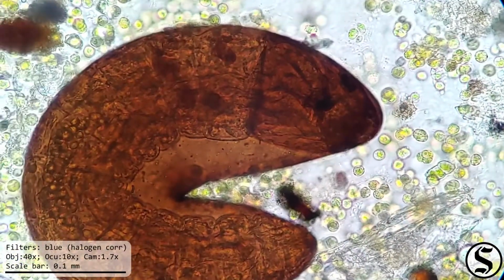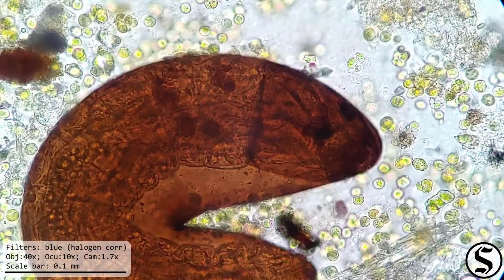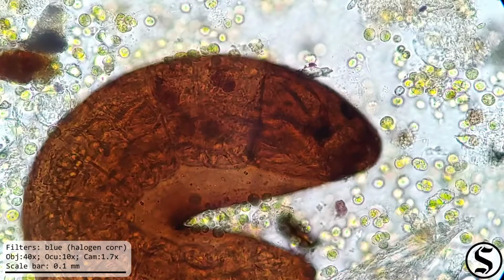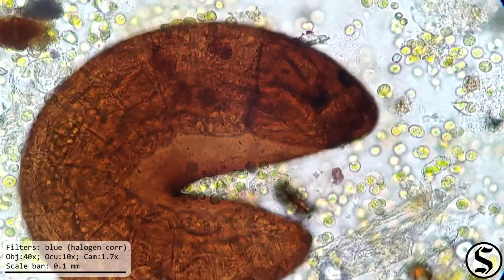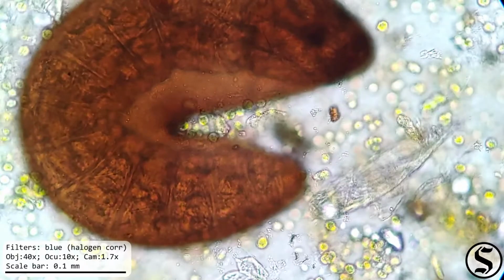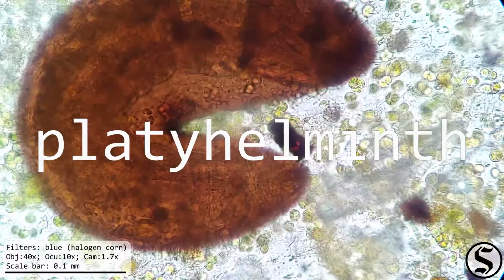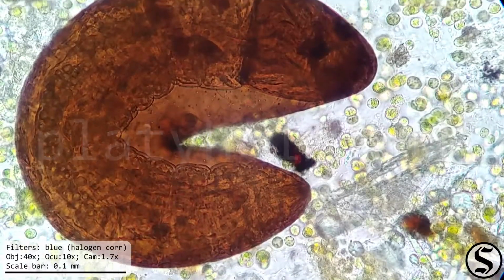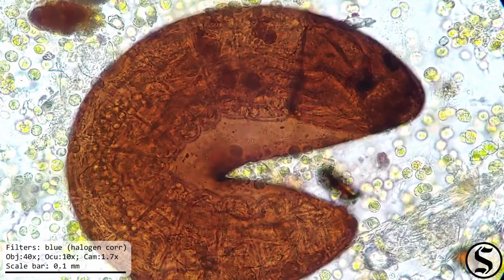Under high magnification, it appears to be something that's in a cyst. That's from the Latin cystus, for pouch. A lot of freshwater organisms use those to weather unfavorable conditions. And this looks to me like it may be some sort of flatworm. That would make it a platyhelminth. That's from the Greek platus for flat and helminths for parasitic worm.